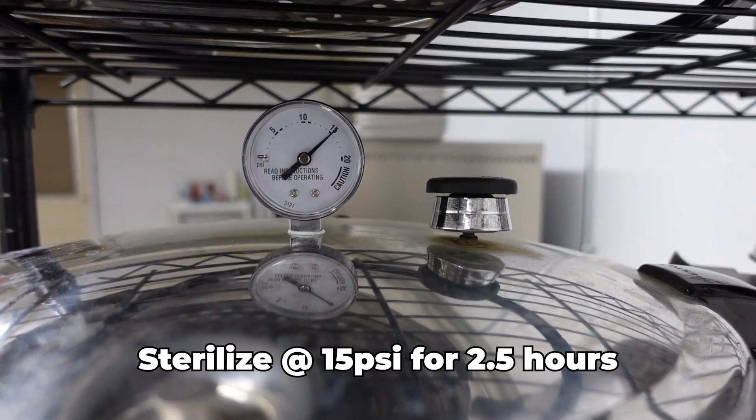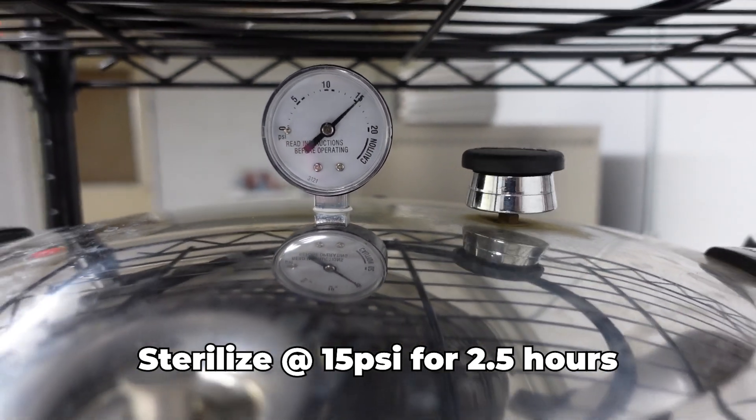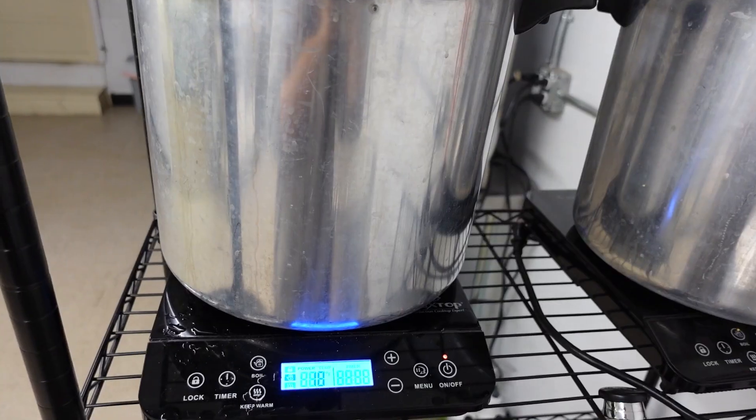Sterilize at 15 psi for 2.5 hours. The sterilization process is crucial for grain spawn. Hydrated grain is the perfect substrate for many bacteria and molds, so you need to kill off any potential competitors before inoculation.